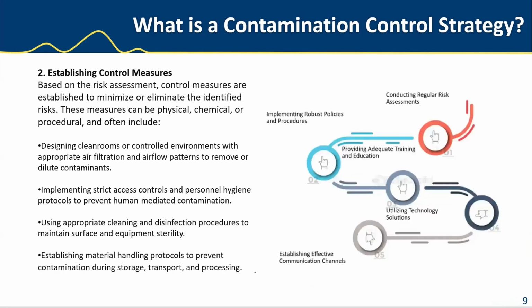And then you want to establish what is your contamination control strategy. Well, you want to establish the control measures. You want to conduct regular risk assessments, implement robust policies and procedures, utilizing technology solutions, and effective communication.